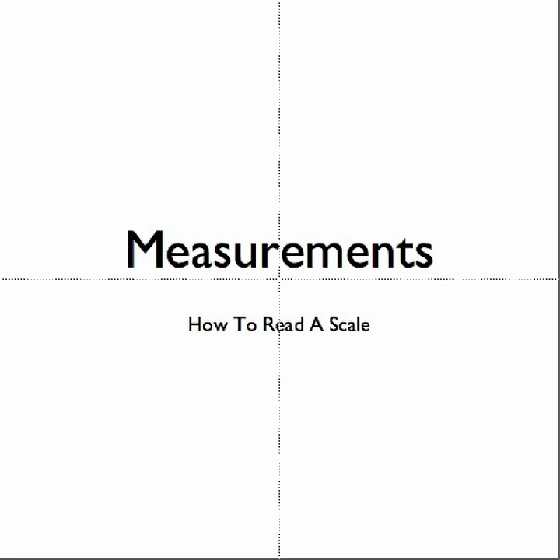In this podcast, we will be discussing measurements and how to take a measurement properly. Now, you'll probably laugh and say, well, I can measure anything. If you give me a ruler, I can measure the length. If you give me a graduated cylinder, I can measure the volume, and so forth. I seriously doubt if most of you can measure something accurately without having the proper instructions.